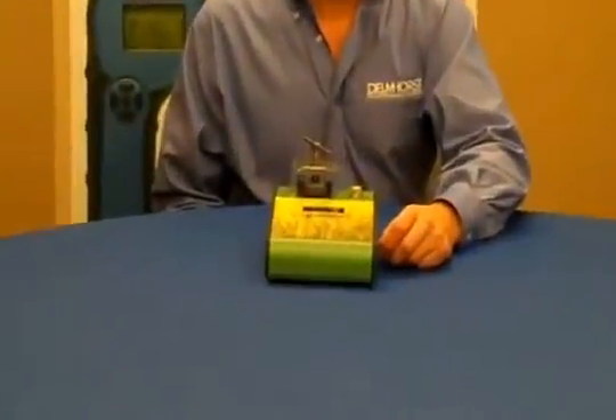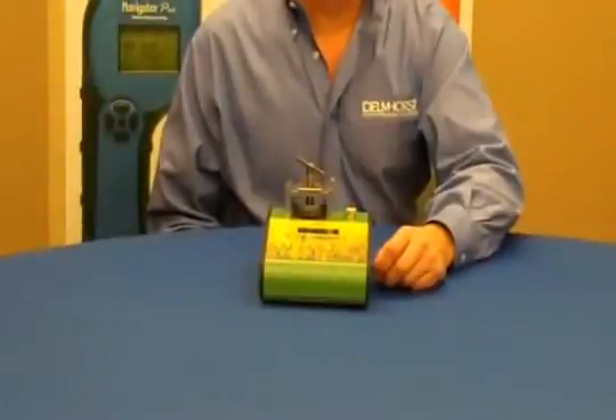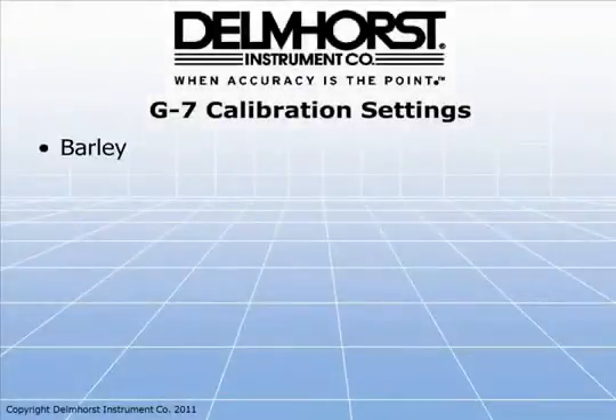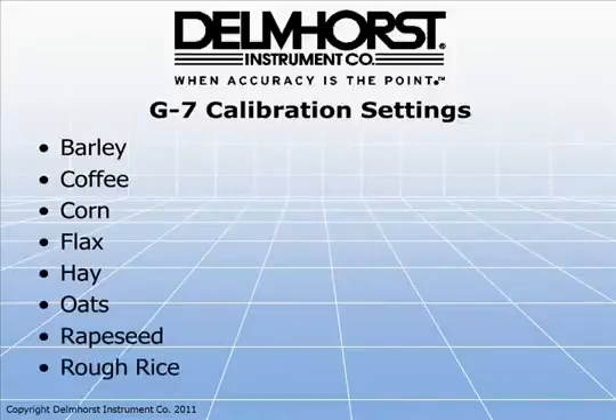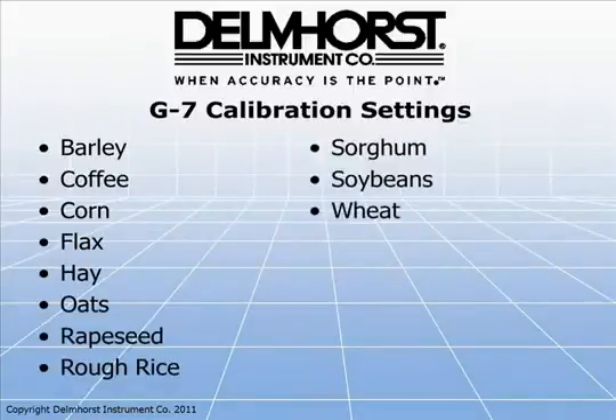The G7 features built-in calibrations so that you can measure moisture in barley, coffee, corn, flax, hay, oats, rapeseed, rough rice, sorghum, soybeans, wheat, and rye.